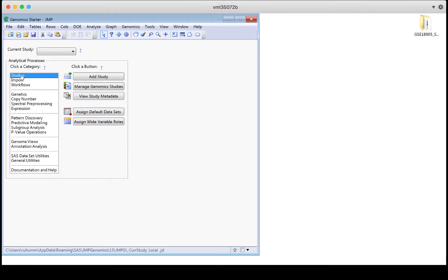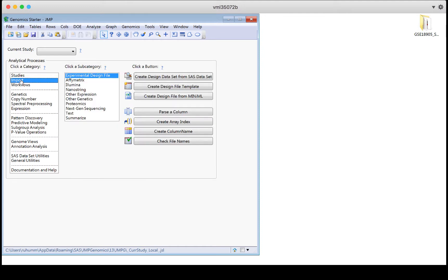We'll start in studies. It's not necessary that you set up a study in order to use JMP Genomics. You can skip this and head straight to the import button if you want. However, setting up studies can be useful for organizing your data files, especially if you have many different studies to keep track of.